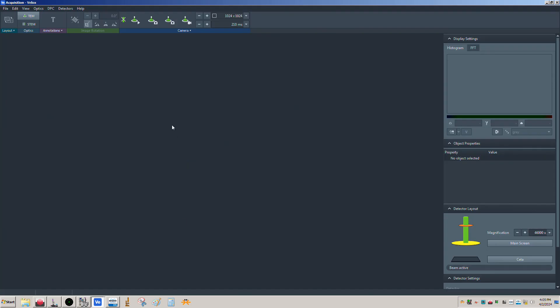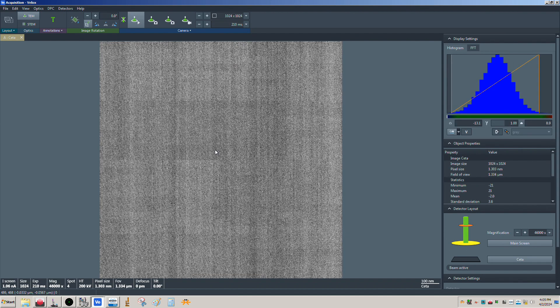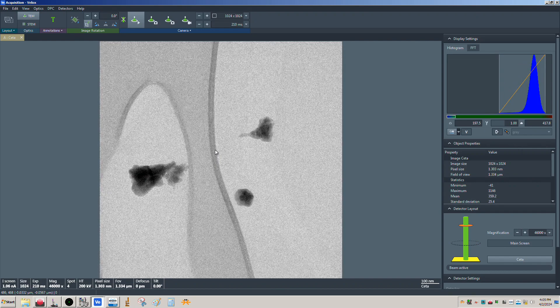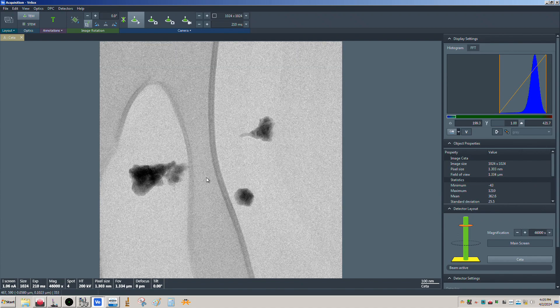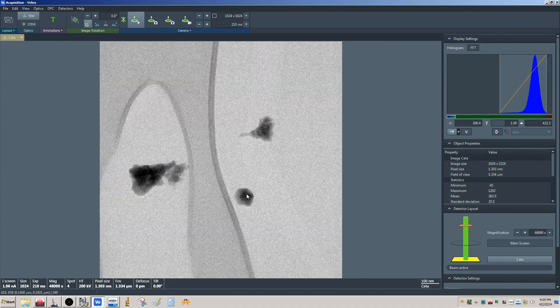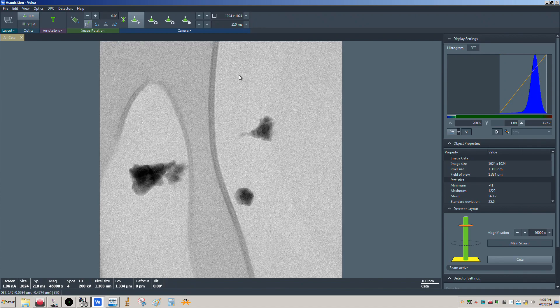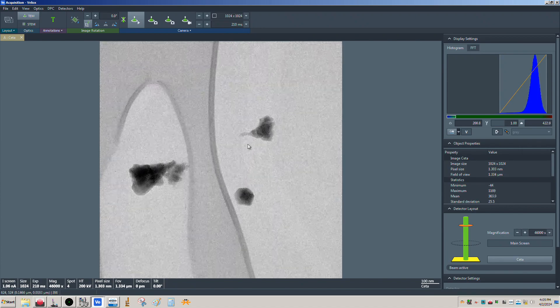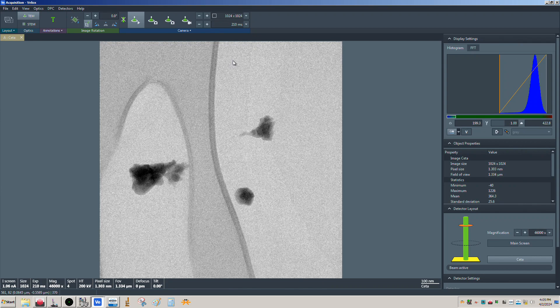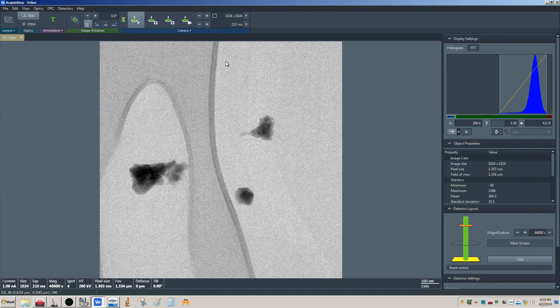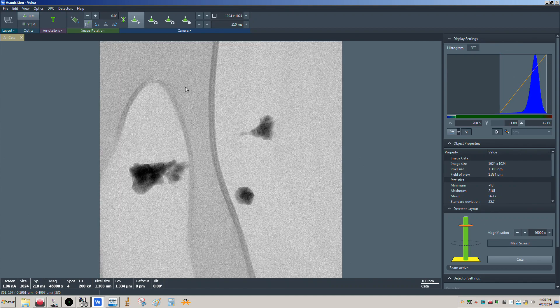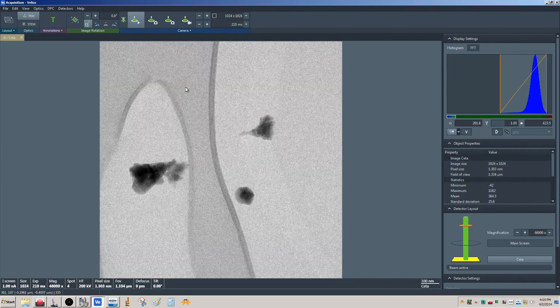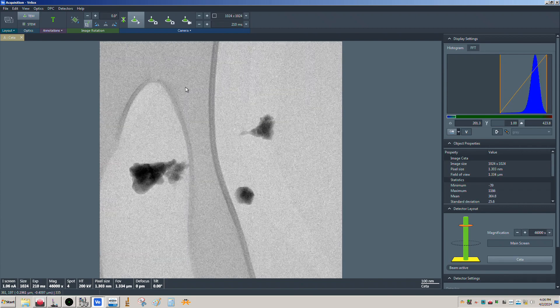Let me go over to Velox here in acquisition and start the live view. There's our image — these are the particles we're interested in. You can tell the sample is slowly drifting upwards, so we do have some movement in the image.